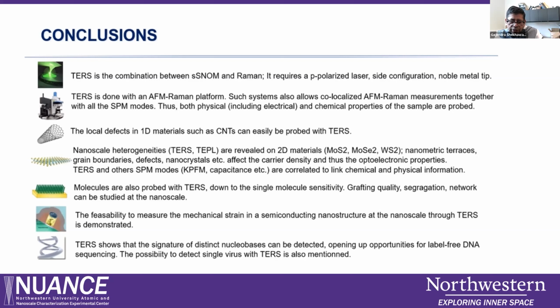And here the advantage is that we also have software-controlled filters. So we have edge filters and notch filters. Edge filters we have in the current Raman system. Edge filters don't allow you to measure the anti-Stokes, and also you cannot go beyond 50 wave numbers, but here the notch filters will allow you to measure both Stokes and anti-Stokes, and you can go down to 5 wave numbers. So you can just switch between these two filters with the software setting.